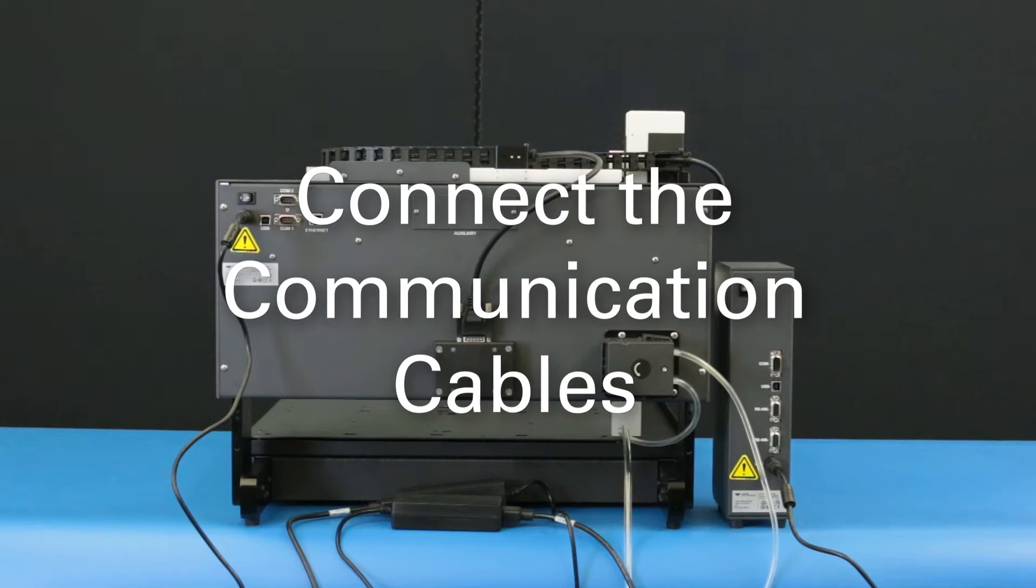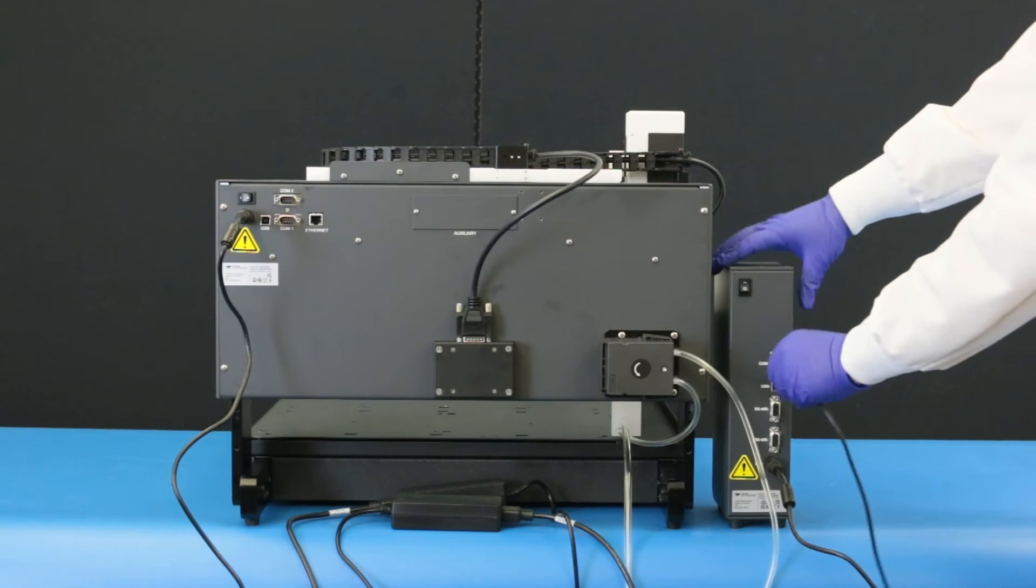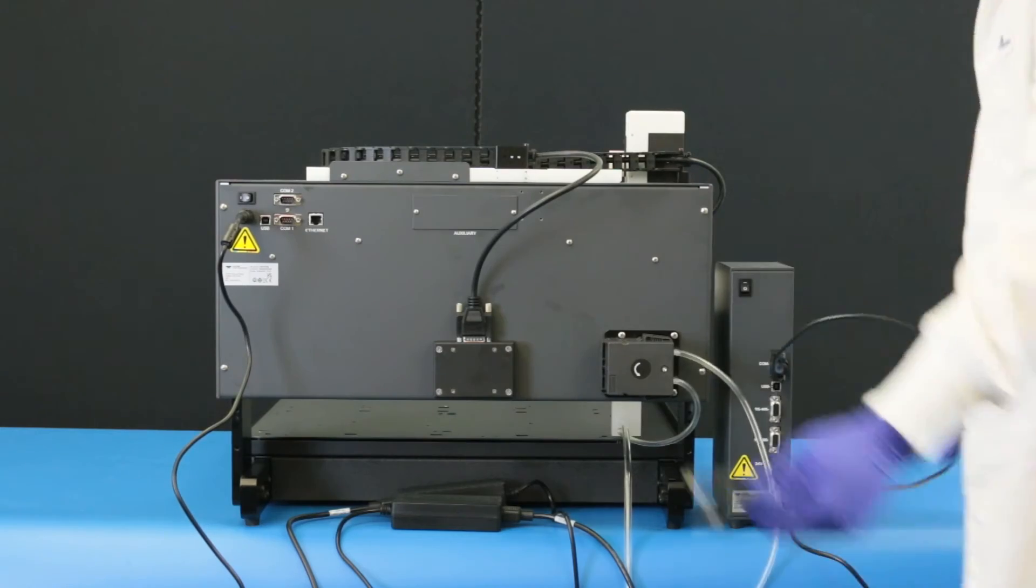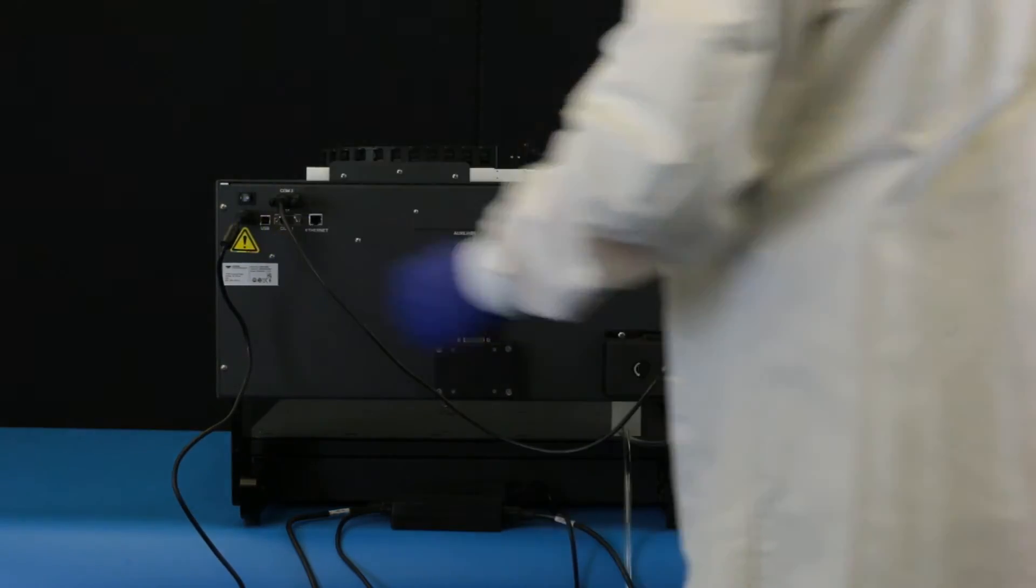Connect the communication cables. Connect a serial cable from the syringe pump module to the COM2 port on the autodiluter. This is the upper of the two ports.